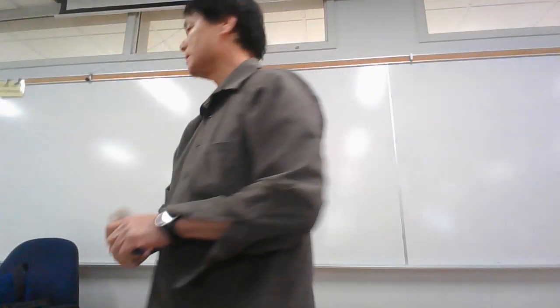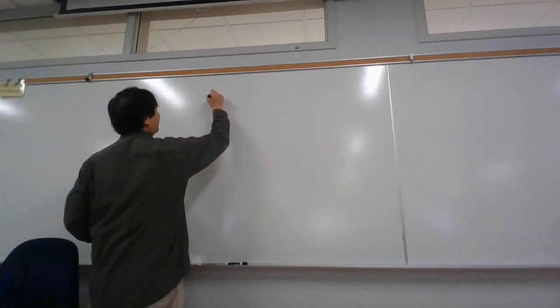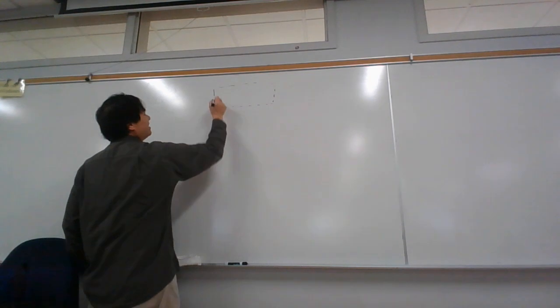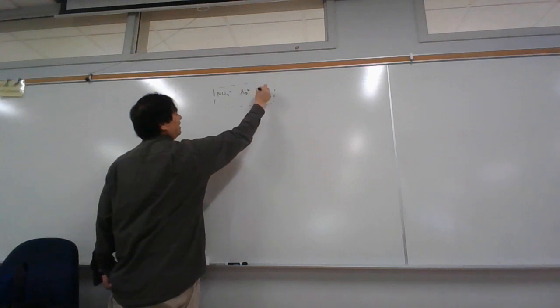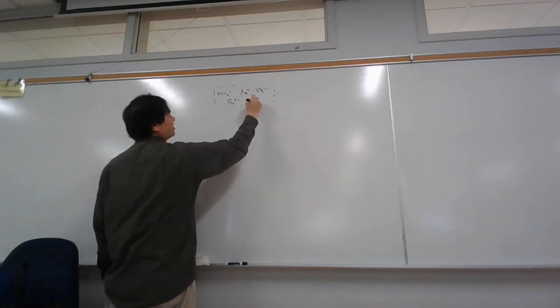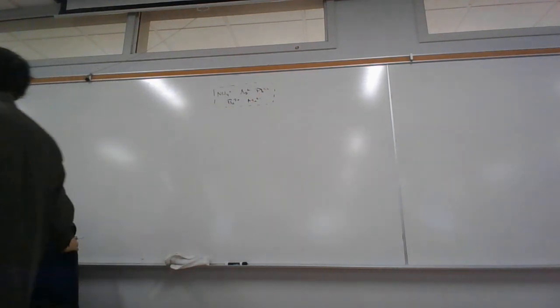You can copy these down. This is going to be for the big analysis. The big analysis, we're not testing for ammonium, but there's going to be ammonium there. There's silver, lead, barium, and manganese too. So we have these 5 cations here.